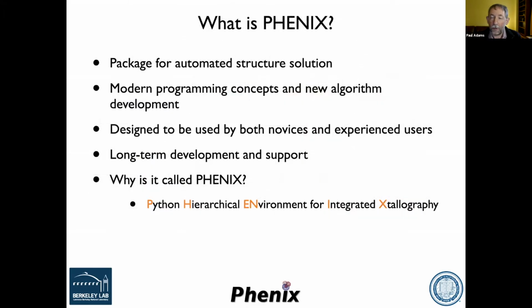One of the goals of PHENIX is to automate structure solution a bit more. It's great to go through the process of solving structures with cryo-EM or crystallography, but ultimately you want to understand the structure and get at the biology. So some automation is helpful. We want new programming concepts and new algorithms, and you'll hear about some of those today and tomorrow. Something which is easy for people to get into, but also allows more experienced users to do more challenging things, with long-term development and support.